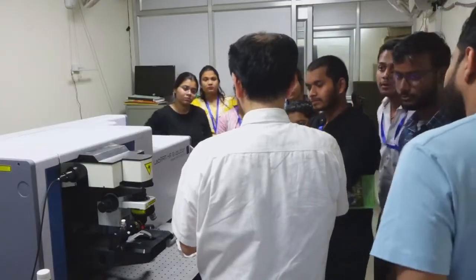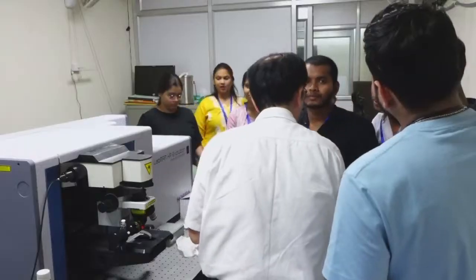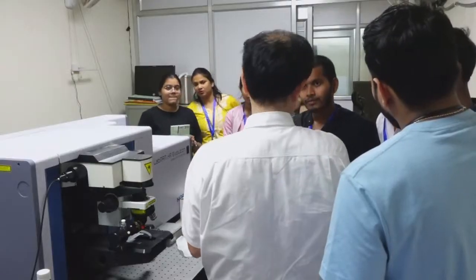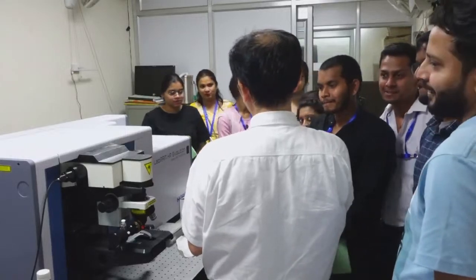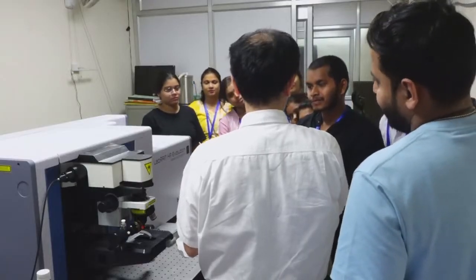And shall we finish? Doppler and collision broadening effect, how can it be measured? Doppler broadening, collisional and Doppler. I'm not sure about gas phase spectroscopy. Sorry.